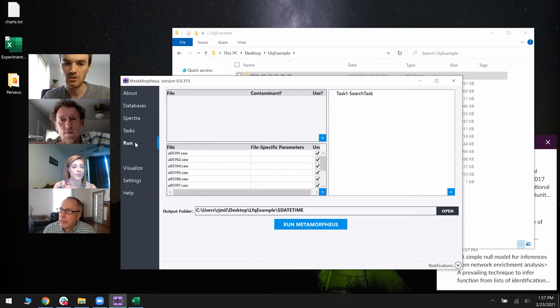centering. So I'm not going to run it because I forgot to download my databases, but I also have it already done. So I'm going to close this. Do you have any questions about setting that up?